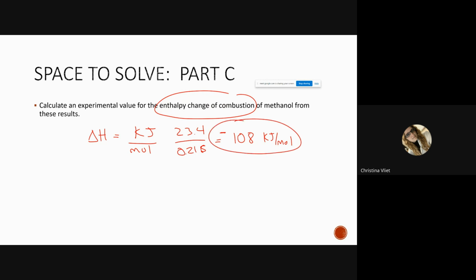All right, so that was the question that we didn't do last class that we needed to wrap up on. Let's now talk about what we need to know to be successful in today's lab. So, you get to do a calorimetry experiment today using the foam cup method. And so, let's go over that real quick before we start the lab. I told you I wanted to get started by 1:15. So, I'll be handing out the lab paper shortly, but just a couple things to note beforehand.